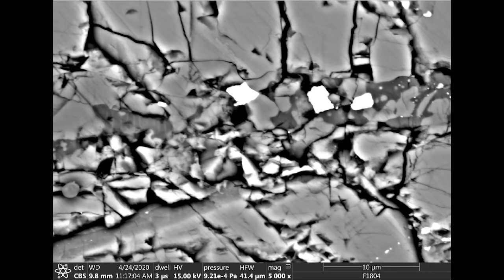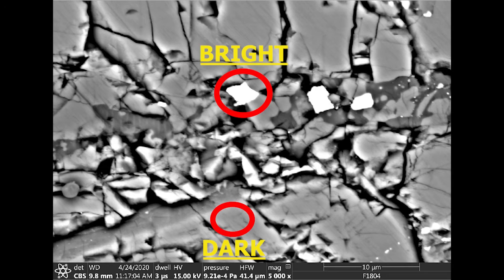To show you what that looks like, I have taken an EDS measurement from two spots on the same backscatter image. One from the bright spot and one from the darker spot. Now, because this spot is significantly brighter, I would expect that it would have a higher concentration of high atomic number atoms in it than this darker spot, as those contribute to the brightness in the image.